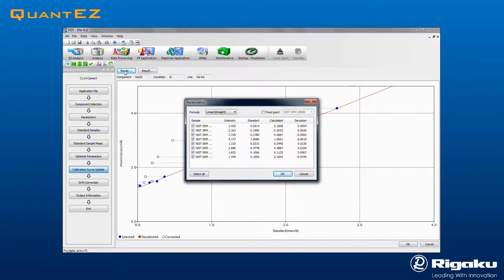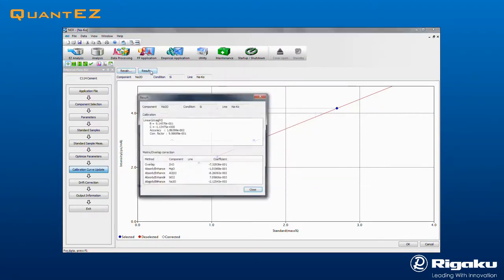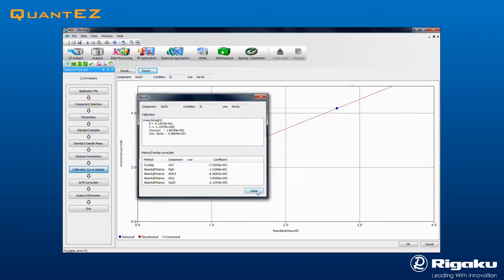Click the Recalculation button to show correlation statistics. Click the Results button to show the calibration parameters and empirical regression statistics. Click OK to exit the calibration dialog window.